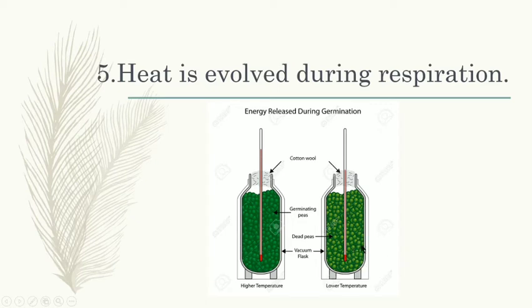That does not allow the heat of the content placed in the thermos flask to escape out, and neither is it affected by external changes in temperature. So we are using these 2 thermos flasks.